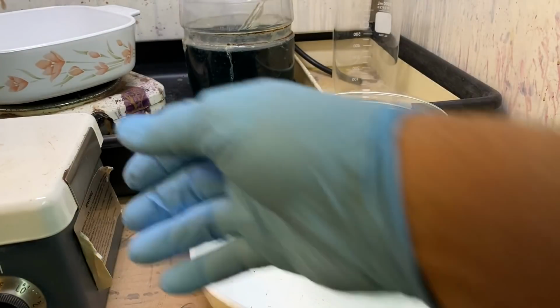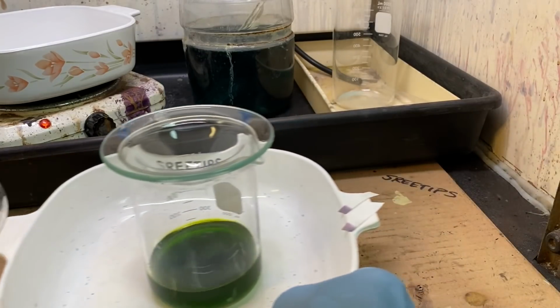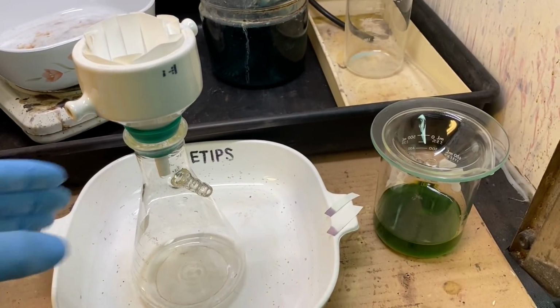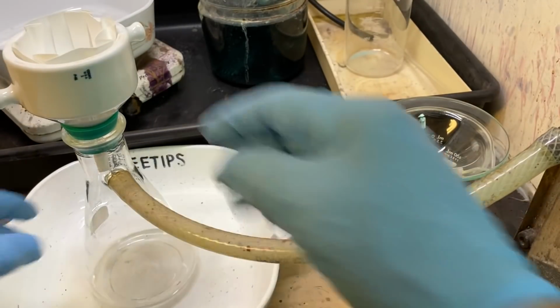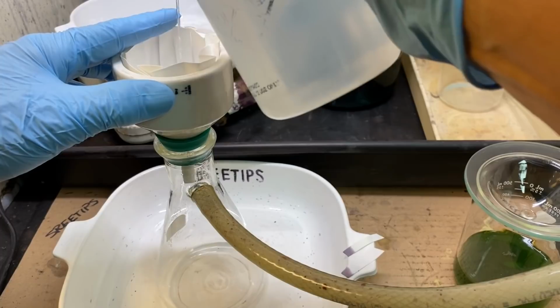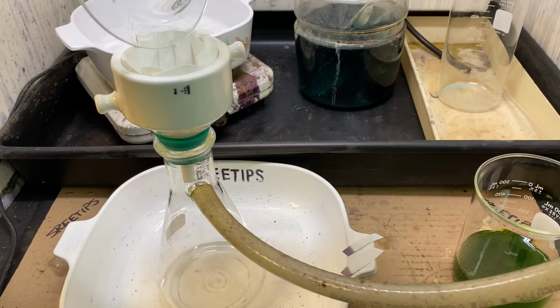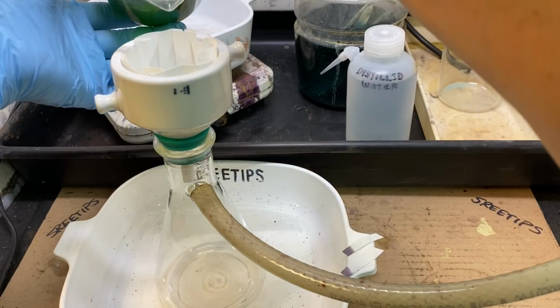I've allowed the solution to cool. Now what we're going to do, I've got a filter flask set up here, and we're going to go ahead and filter the solution. I've got a specially prepared filter paper here that rises up the edge of the funnel. What that'll do for me is capture any of the solids so that nothing goes down past the filter and gets in the funnel. And now we'll go ahead and pour in our solution.